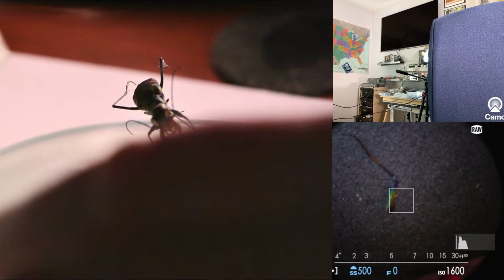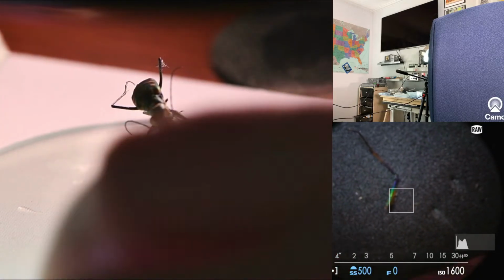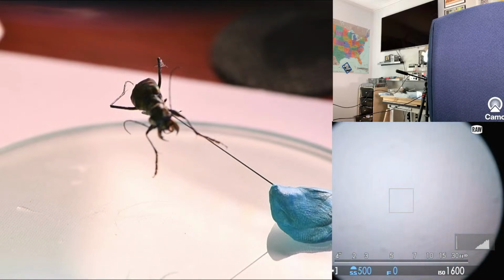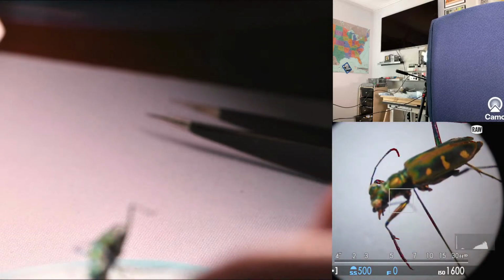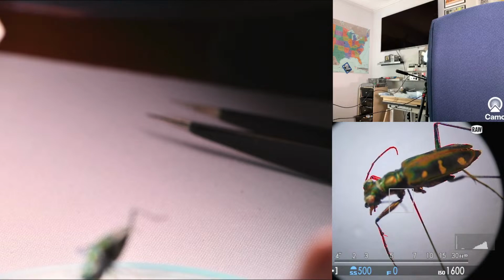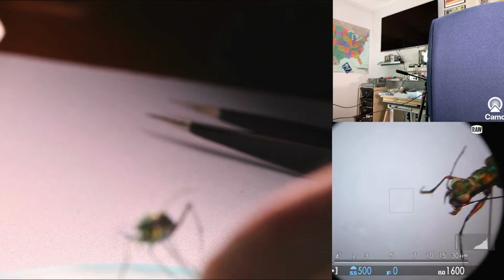Okay? Now the next thing to do is to look at the bug and look at the other side of the bug. So I'm going to move my little mini dissecting block, which is a piece of closed cell foam rubber. I'm pulling some pins out that I use to anchor it. There we go. So I can move it out of the way for a second and show you the bug. So I'll slide him in, and let's see if we can get some better light on that. So this is the bad side. This is the side we're going to be fixing. Get him in better focus. There we go. Let's flip him over and look at the good side so we can examine the other extremity.